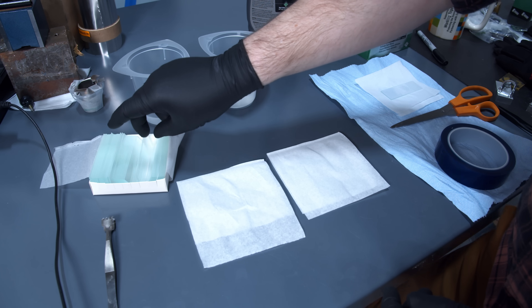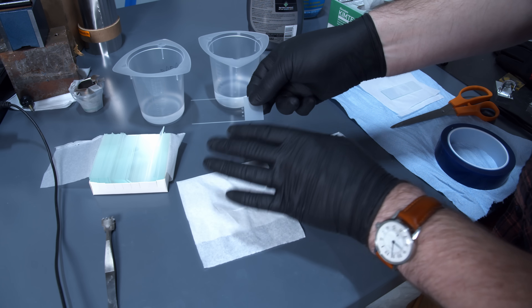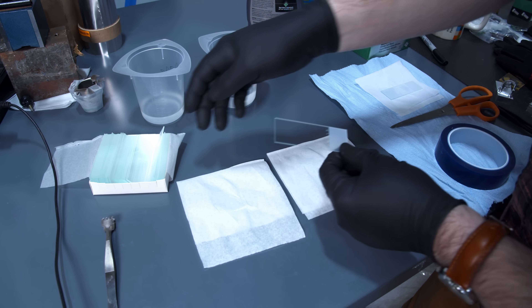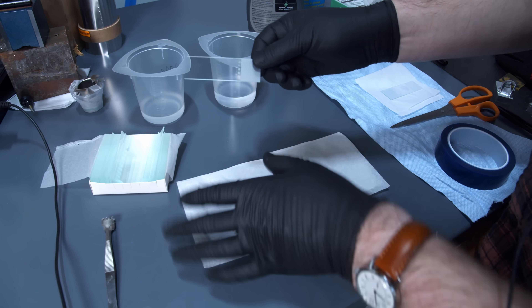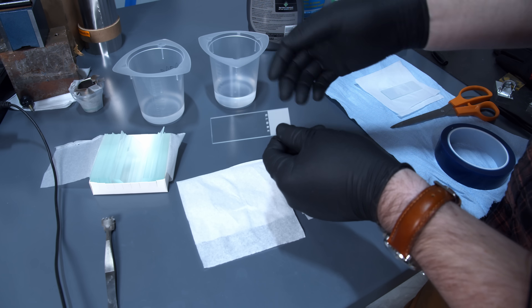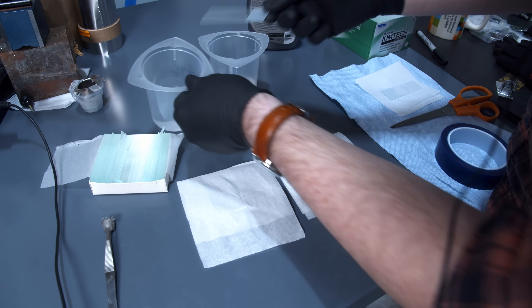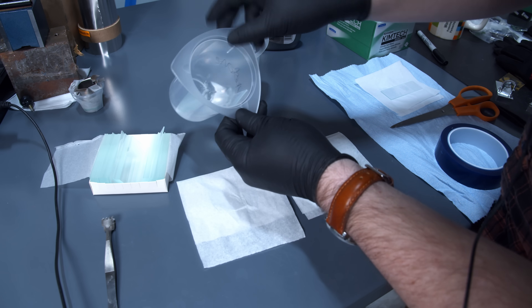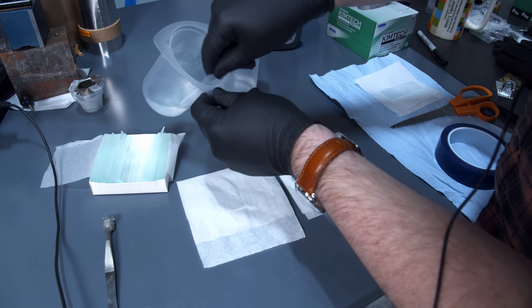For today's test, we're just going to use regular glass slides as the substrate. It's important to clean these first though, because they come with some type of very thin coating that helps keep them from sticking together in the package, which will definitely interfere with our test. It's kind of hydrophobic itself. So first, we're going to dunk it in some acetone, give it a bit of a swirl, and whatever the coating is comes off in acetone.